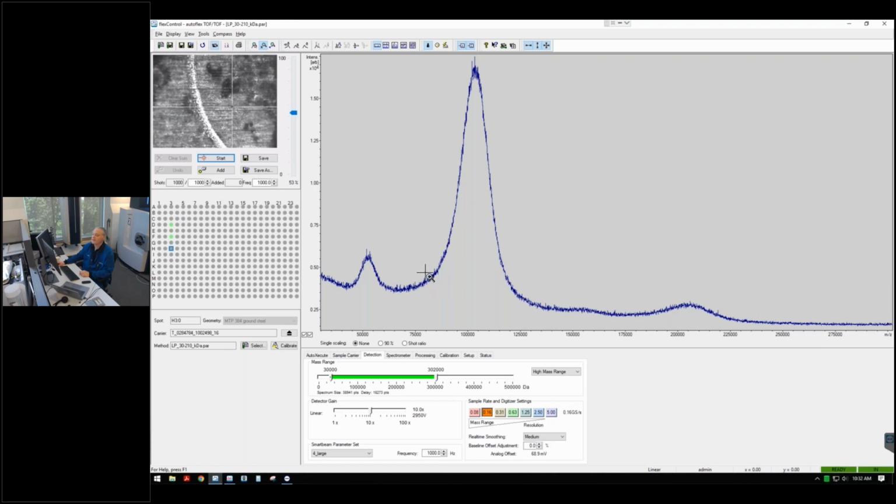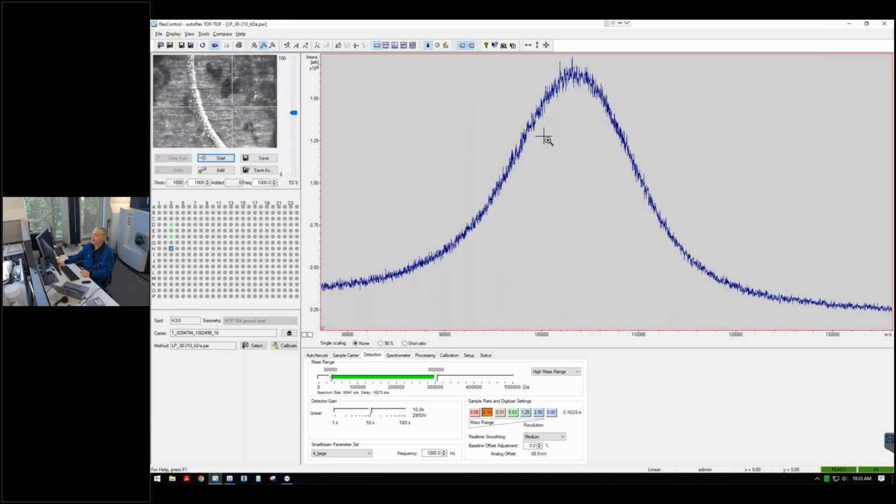So here you can see that we don't have the type of resolution we had at the lower molecular weight in the reflectron mode. It's a broad peak, kind of reminiscent of a GPC trace. However, it is an absolute molecular weight. Again, we were creating pseudomolecular ions, so a molecule with some sort of cationizing agent, and then we're detecting that, but we don't have the repeat unit definition that we had in the lower molecular weights. So here it's just a broad peak. Now we could play with this for a while and try to get that type of oligomeric resolution where we'd see the spaces in between for the repeat unit. But again, in the interest of time, I'm just going to collect some data.